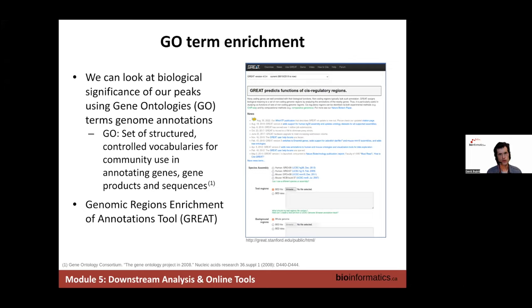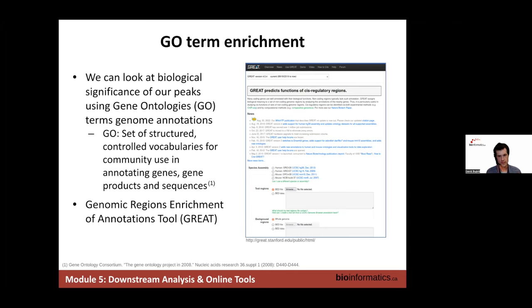Jumping to GO-term enrichment — we can look at the biological significance of peaks for a given list of regions in a BED file using gene ontology annotations. Gene ontology, or GO, is a set of structured controlled vocabulary for community use in annotating genes, gene products, and sequences. The tool we'll use for this is called GREAT — it's an online tool, a website where you upload a BED file, choose your reference genome, and it runs the analysis in the background. Being a public resource, the size of BED files you upload is limited to save on computation power.